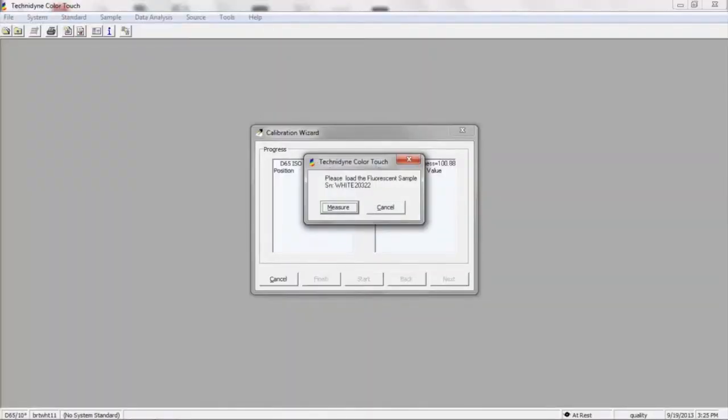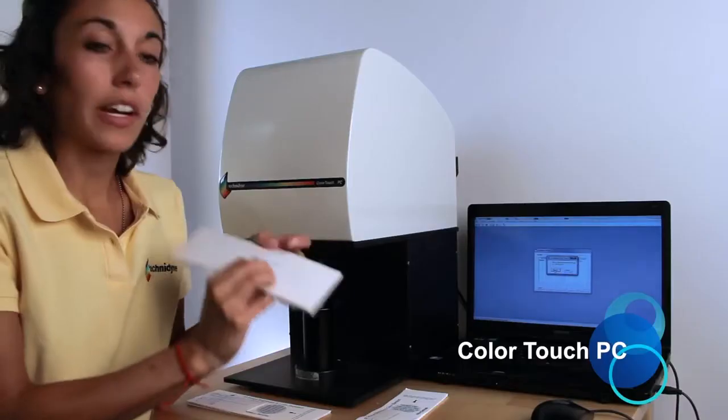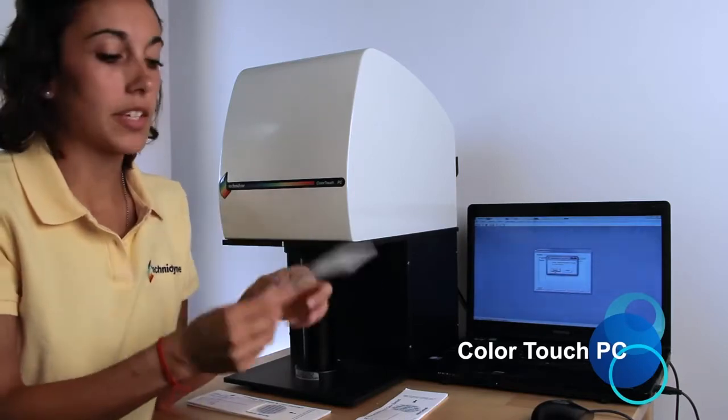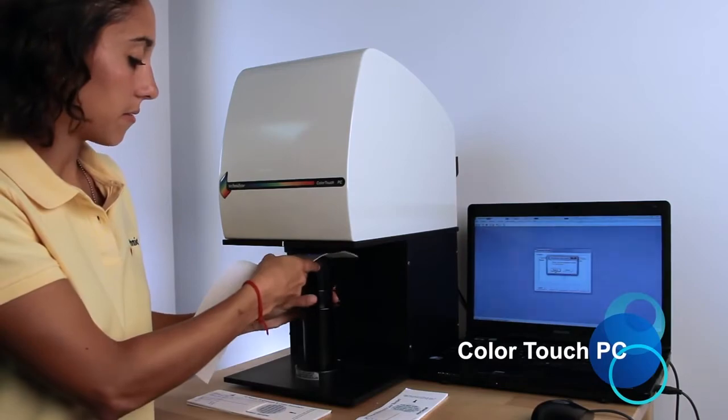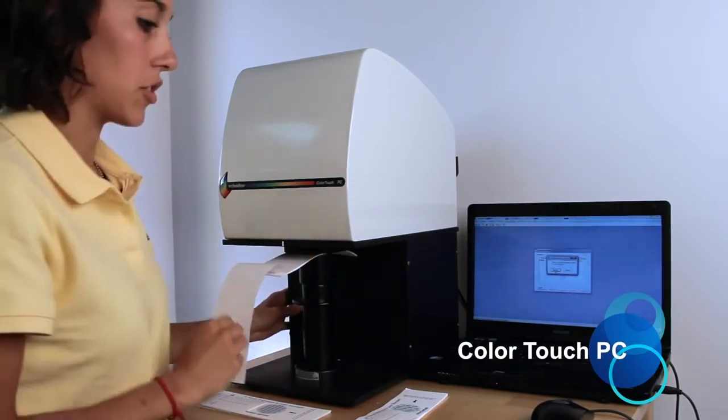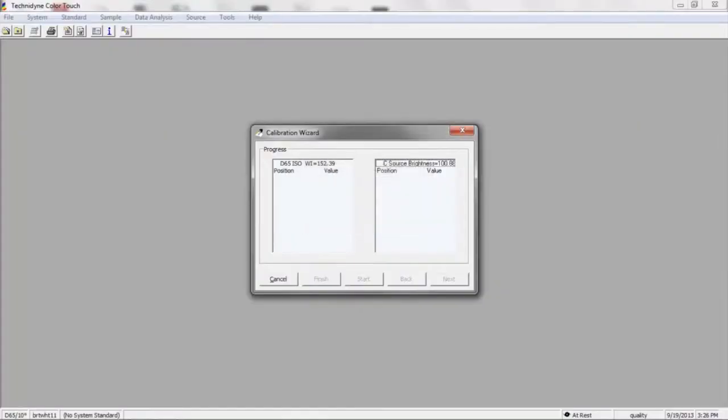Next, it wants us to load our fluorescent standard. Now the serial number for the fluorescent standard is on the back. So once we verify that that matches what the computer's giving us, we can move that front sheet, load our standard, and press the green button to measure. This is to establish proper filter position for the D65 and C sources.